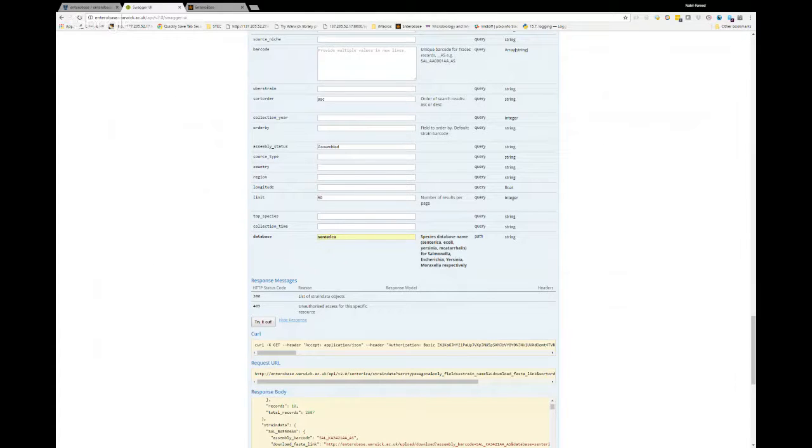Some other questions. Allele profiles, yeah, we're going to come to that next. Is there a follow-up on the issue in Bitbucket? Alleles are missing when all alleles are requested. I went back and checked. I think all of the alleles should be up. I did amend that. I'm not sure. That should be done. But another question is, how can we know which are the possible values for query fields in strain data table?